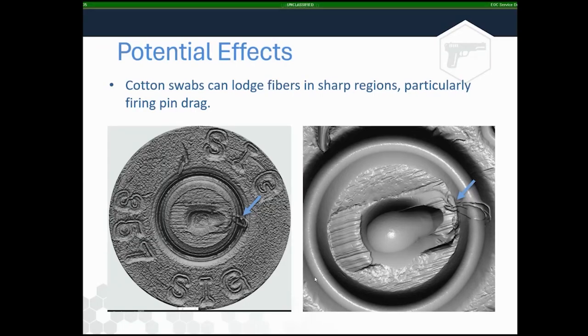You may be inclined to be like, oh, we all know that that's fiber, we can go with it. For myself personally, because I'm the main person scanning here at our lab, I prefer not to have images like this go into case files or anywhere else. So I will make sure to go back and get them out, maybe just for my own ego, but just to make sure that there is no debris left on the cartridge case that could have been removed easily.